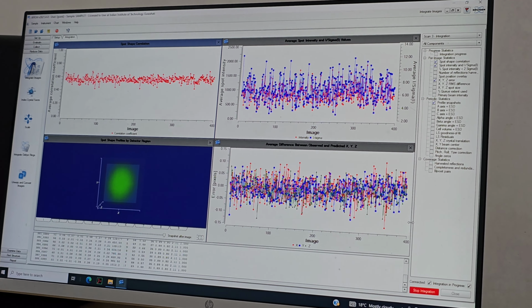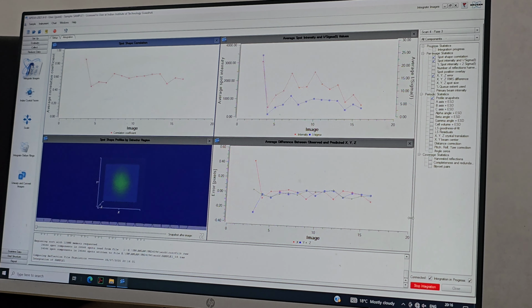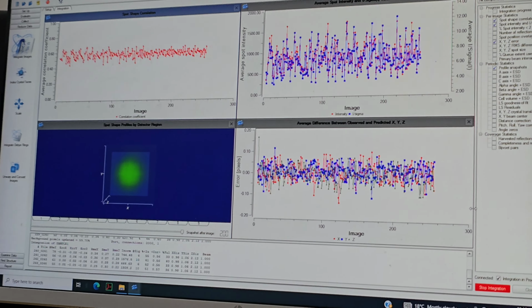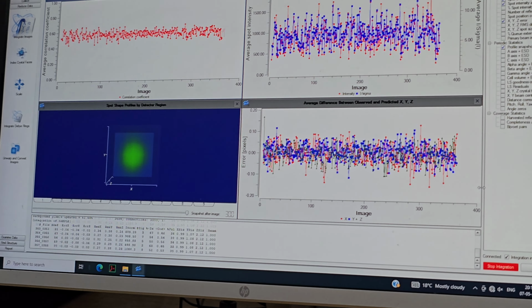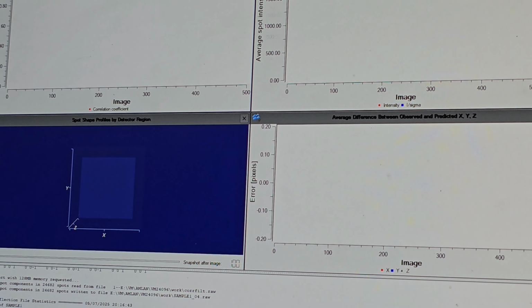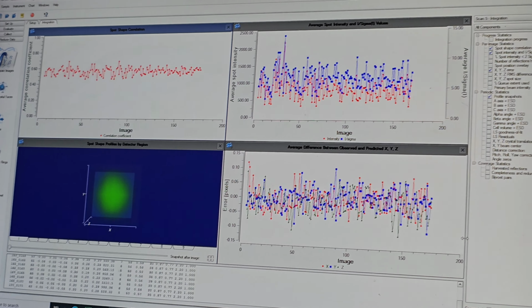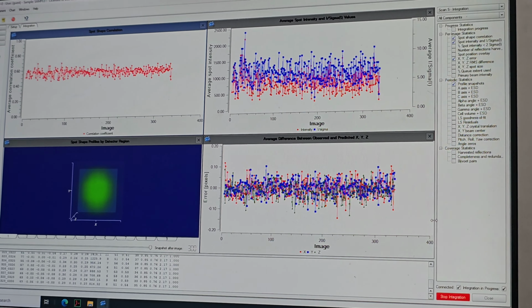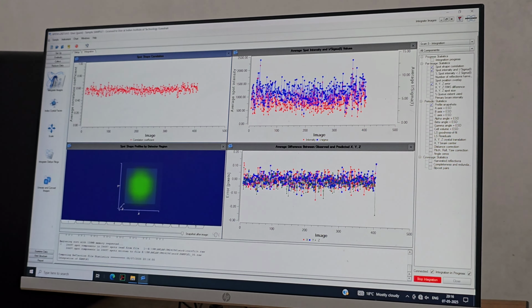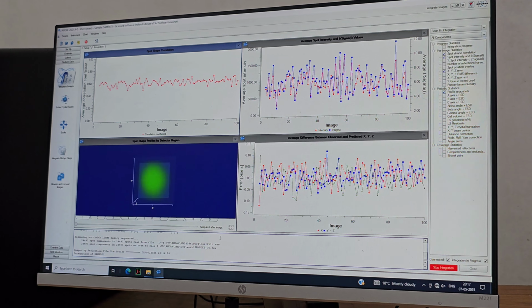You can see the lines and the progress of the integration. Close to the monitor, you can see the real-time analysis of that data. It will take a few minutes. After that we will proceed to the next step. And in the refinement result here you can see how many spots are integrated in which folder, like that. All the information is below.